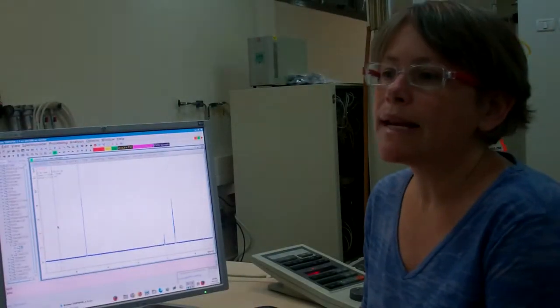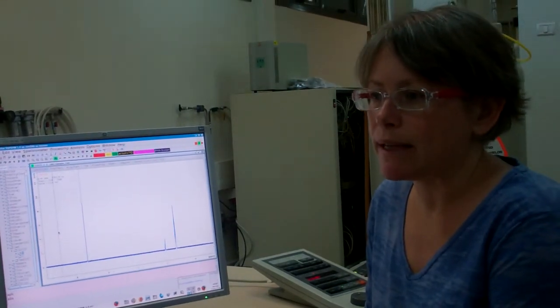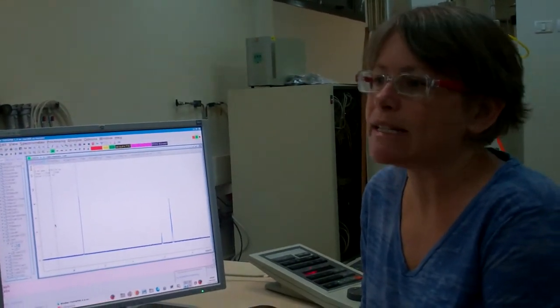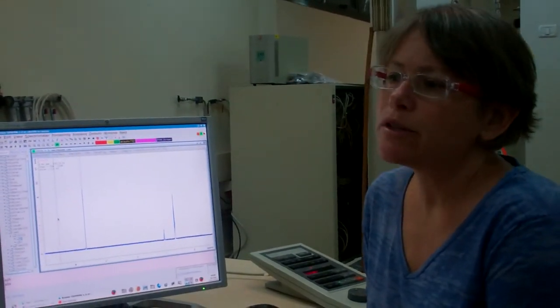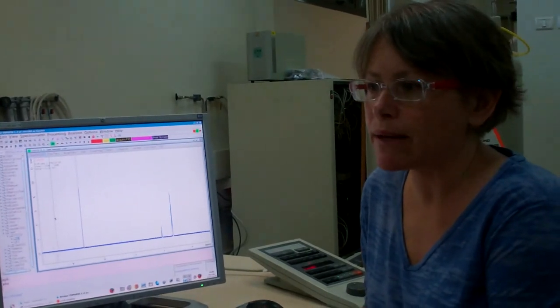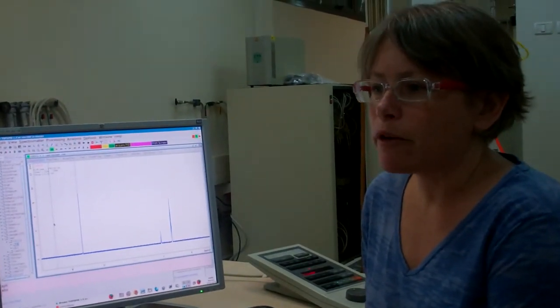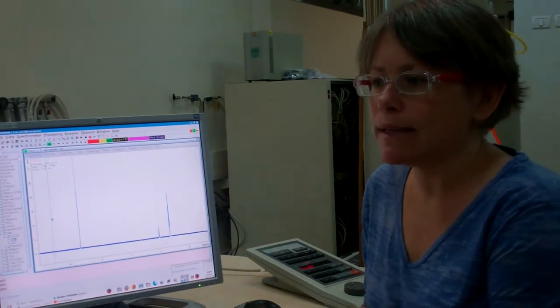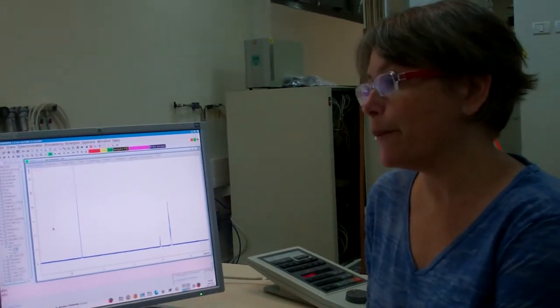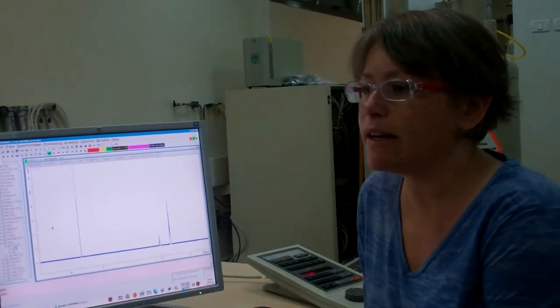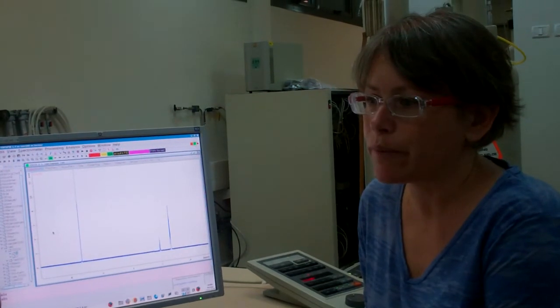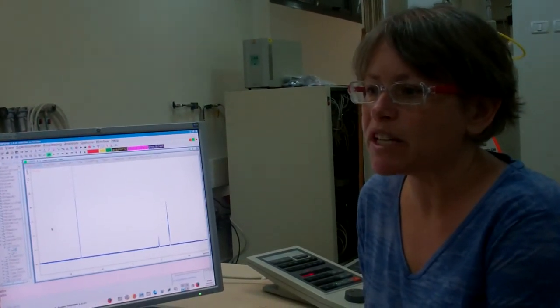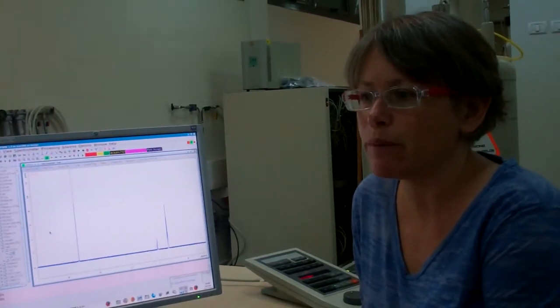The next processing step is to correct the baseline. The baseline is straight and is at 0, so the correction won't have much of an impact. The automatic correction is done by typing ABS and then enter. There, and now the baseline is still straight and on 0. A well-defined baseline is particularly important for integration of the peaks.